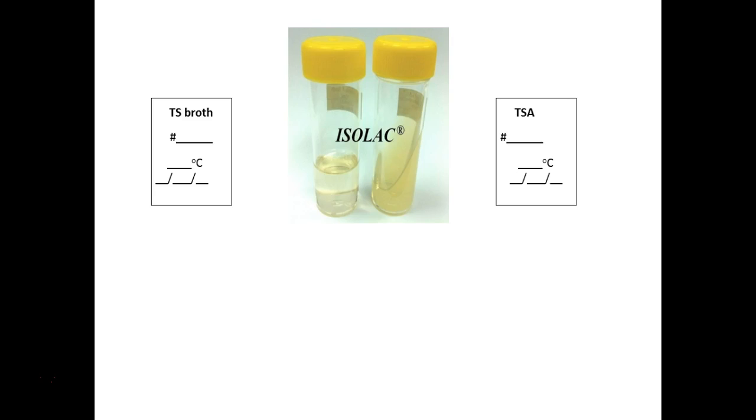Unlike gelatin that you might put in your shrimp molds and stuff, anybody know what that's made out of? Protein, which it can be hooves of horses, yes. So it's protein, and just like us, lots of microorganisms like to eat it. So then it doesn't work as a solidifying agent, right, because they're eating it. Also, what do we have to do to get it to solidify? We have to keep it cold, refrigerated, right? At room temperature even, it starts to what? Melt, right? So it's not a good solidifying agent. So we use agar. This was a wonderful invention way back when.